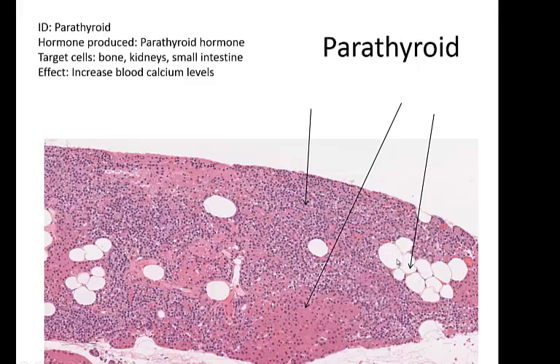And parathyroid gland usually has a bunch of fat in it. So here is fat. And remember that here's fat cells here. Fat cells, oxyphil cells, chief cells. So that's what you look for when you see a parathyroid gland. Just a bunch of uneven staining everywhere. And the parathyroid gland is right behind the thyroid.